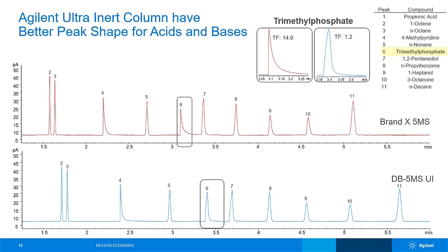If you want additional polarity, for example, we see a lot of it for MCPD analysis in oils or in food samples. We need a little bit more polarity, and I've seen customers using DB35MS UI. So certainly we're trying to cover all range of applications with ultra inertness.